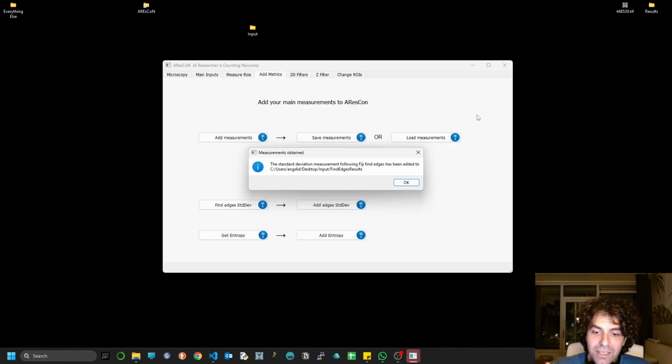Having said that, if you stop running the code and you've already initiated the batch process macro, a series of steps in Fiji, then Fiji goes by itself and it continues running. So you have to close Fiji too. This is just a precaution in case something goes wrong, but don't be concerned. It's highly unlikely that it will mess up your computer, as long as you're not really playing with your most essential files. But everything should go well, really. I'm just warning you in case something goes really wrong. Just kill the terminal and it's fine.